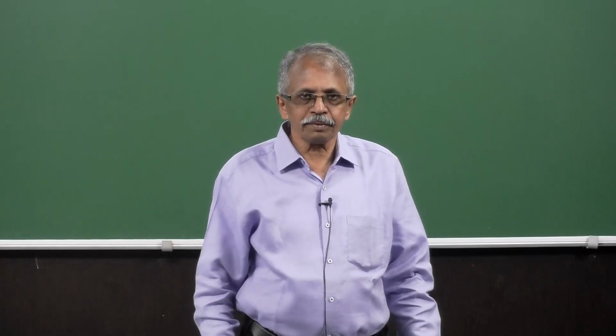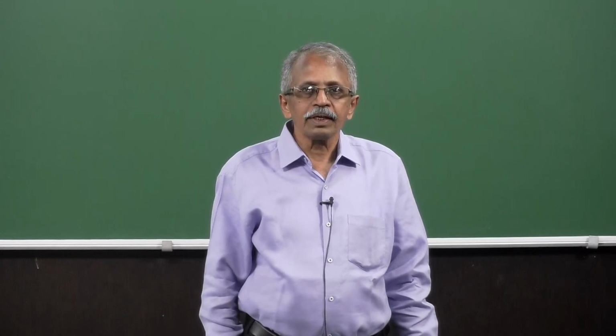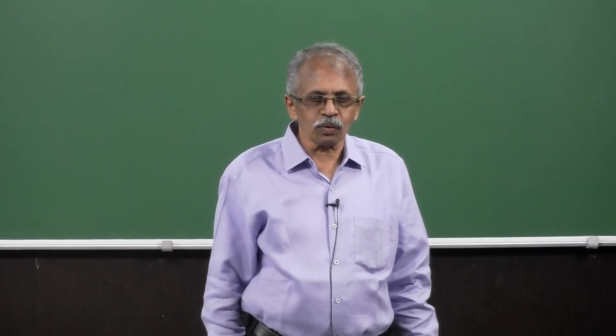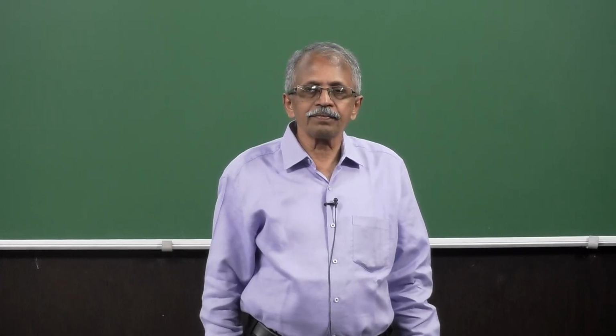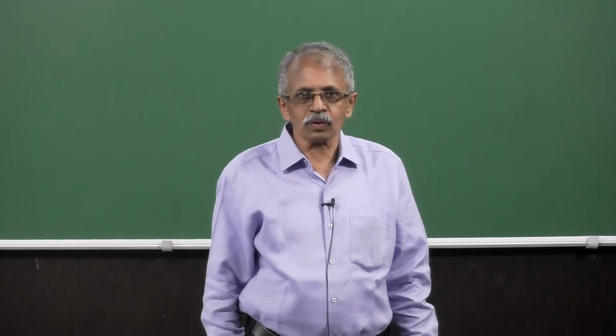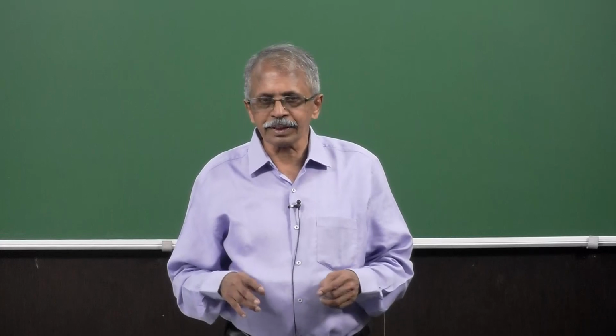I'll bring the recapitulation of this towards the end of this particular course. And then lately I have done the diffraction technique also. And the last topic that we will be focusing on in this particular course is microscopy. So that will cover the analytical, spectral and microscopy techniques.